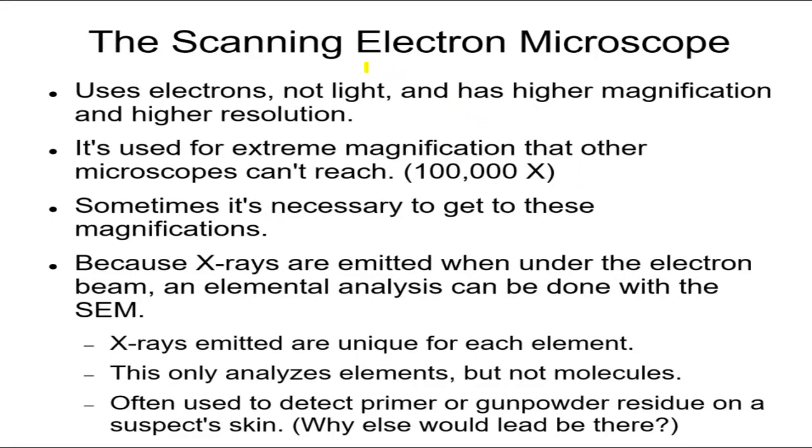So that is the microspectrophotometer. The microscope also is a spectrophotometer that can find materials based on what gets absorbed and what does not get absorbed. There is also the scanning electron microscope. It's really a microscope. It's not a spectrophotometer in any way, at least not at this stage of the game.